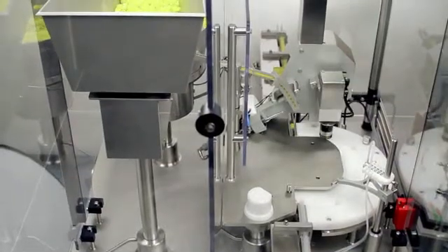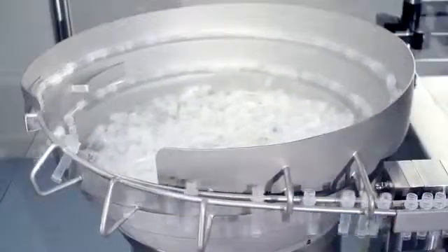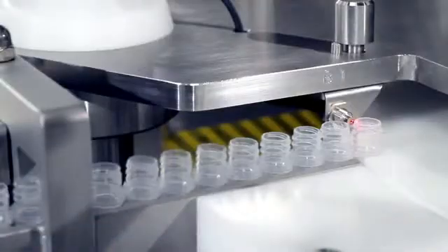Our automatic filling and capping systems have been installed in more than 37 countries, serving the diagnostic, biotech and pharmaceutical industries.